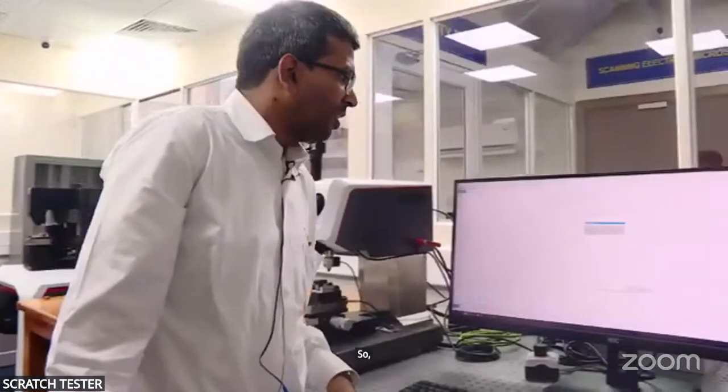This is not every time. So when you open the software for the first time, the system needs to do the initialization, and you don't need to repeat it every time.